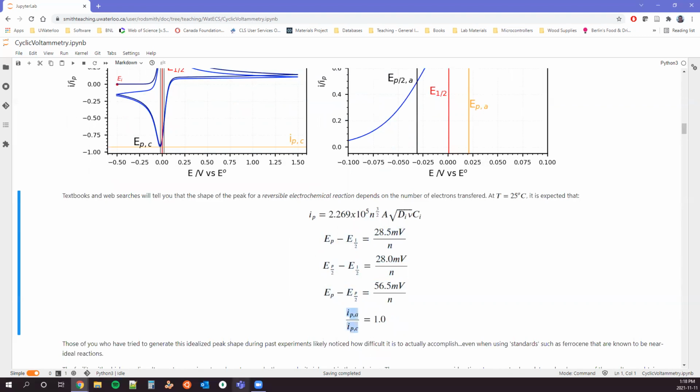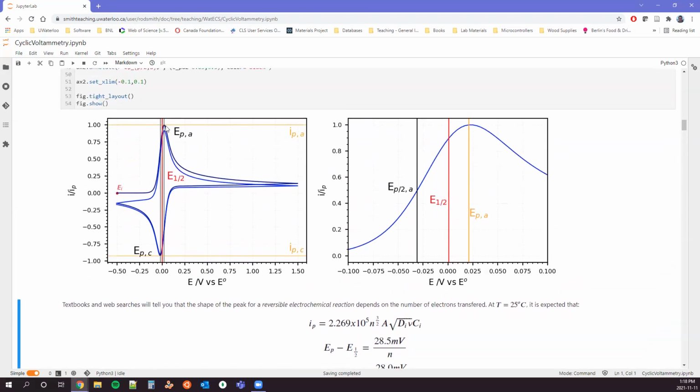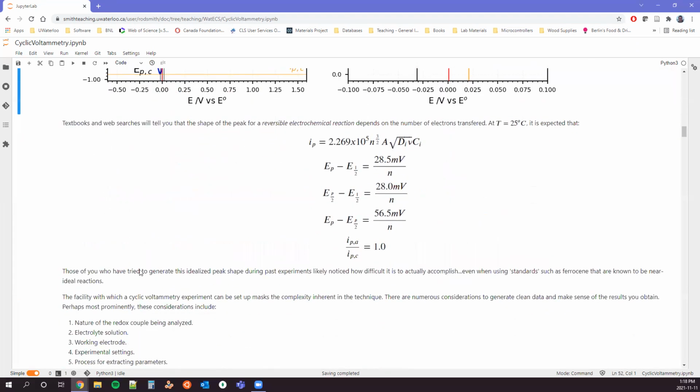If it's fully reversible, we expect IPA divided by IPC to be equal. And so as you see, if we just look at hard currents here, so this is normalized by the IPA value, excuse me, you can see that the hard numbers are not identical. And so there's something else going on in the background, right? We do have to apply a little bit of thought when we start analyzing what we see here.